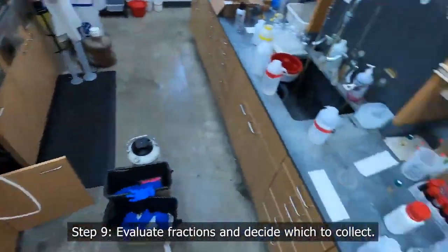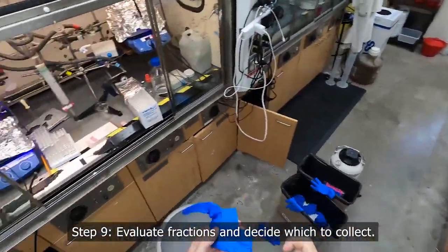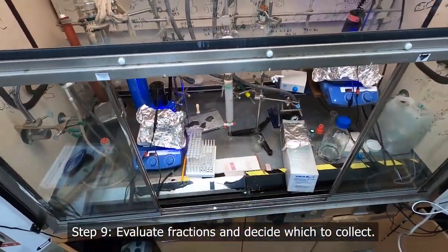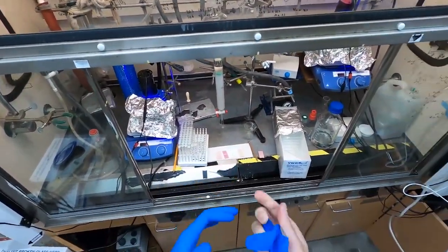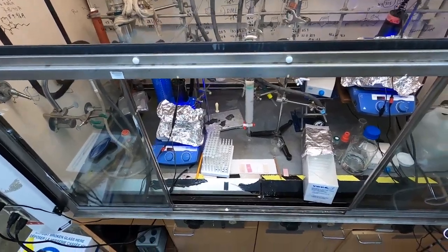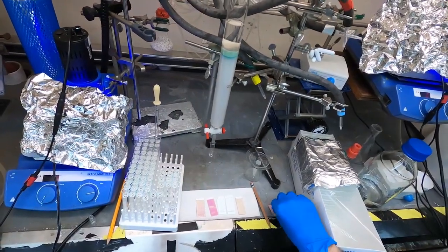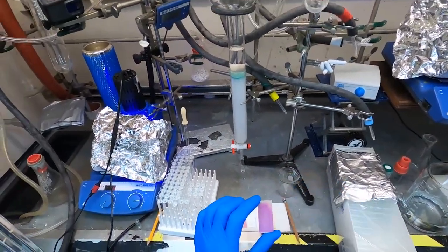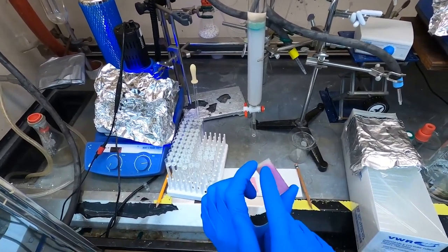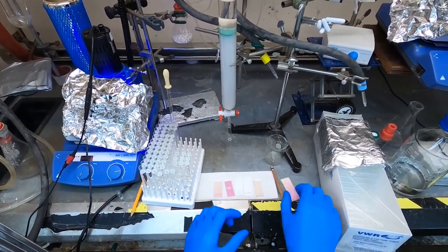Okay, so we've run our column and the product has completely eluted out, so we can be rest assured that we've gotten everything. And we did a little bit of TLC of some of the fractions to see where the product is. And so first what we did here is I subjected my grid plate to the KMnO4 treatment, and sure enough we can see that the spot is in row 10 there.